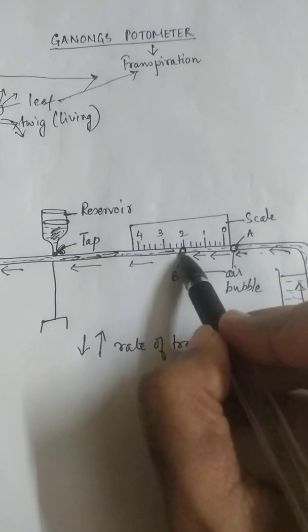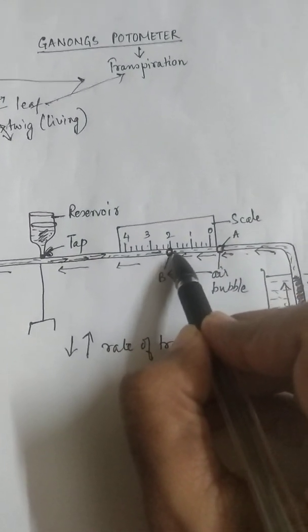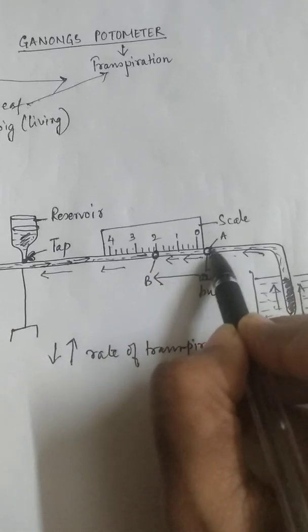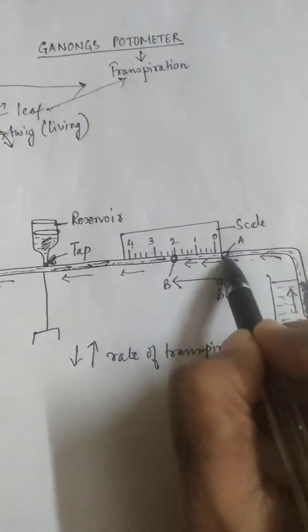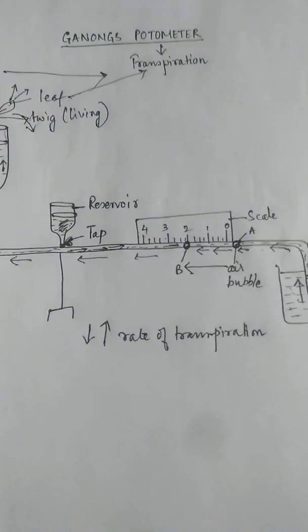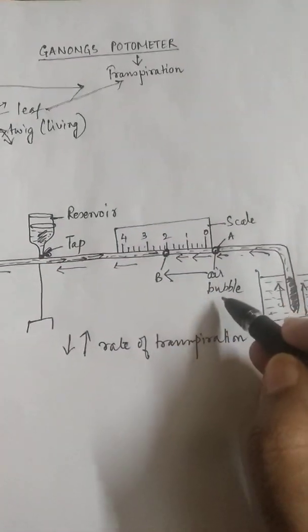And it will be pushing this bubble which was at B and it will force it to go from here to here. And then the moment the bubble comes over here again I turn off the tap. So my bubble is fixed at position A.